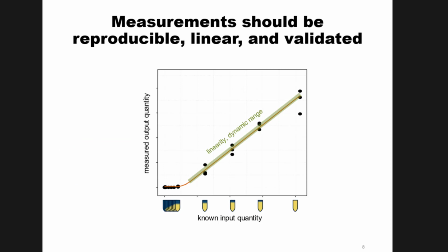So Andy told us a little bit about calibration curves. And just in case you're not an analytical chemist, the idea behind a calibration curve is that you have some set of samples, some dilution of samples in the matrix that you're interested in. Andy talked a lot about plasmas. There are specific plasmas you can get that are depleted of your protein of interest. That might be one way. But I think Andy's lab lately has been using an equivalent organism that is evolutionarily diverged enough that you won't have overlap. That is one way you can do a matrix like that.